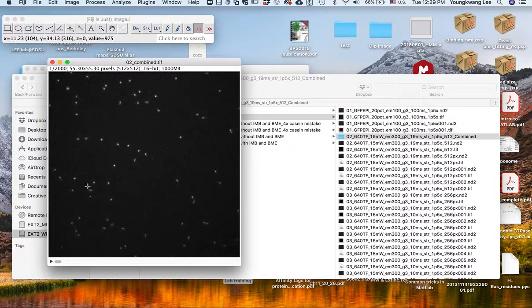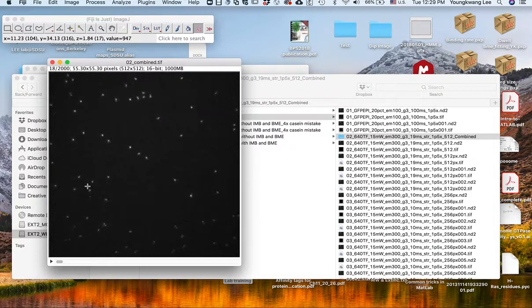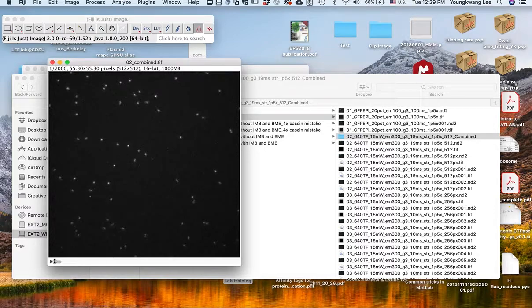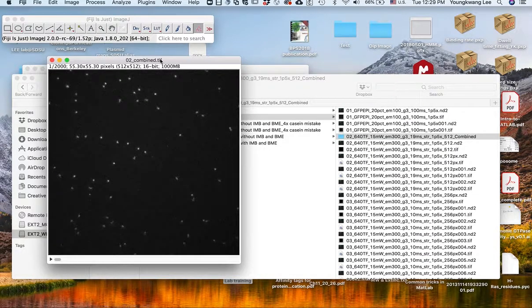So just check your image to see if it got nicely combined. This checking process is especially necessary if you have combined different files. You may notice that in the previous window you have 2 scroll bars.